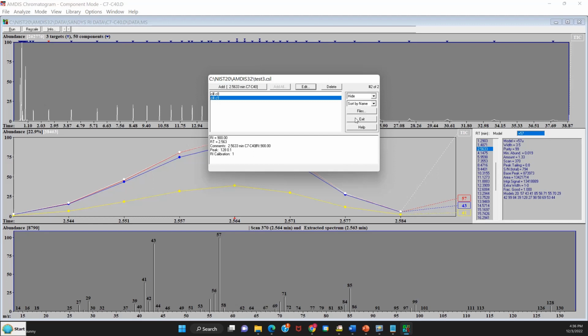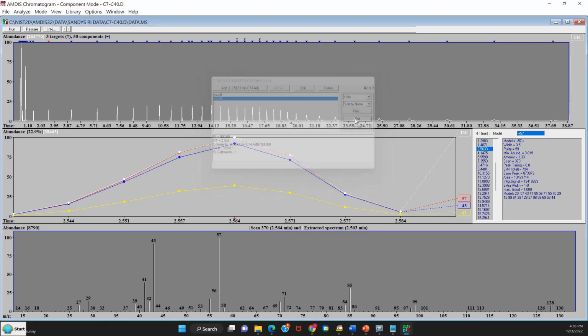So that's pretty much the process, and when you exit this, you'd be able to go find that file and open it up in Notepad and look at it, edit it if you needed to do some more editing, and make sure it's okay. So that's pretty much the whole process, and so I hope you found this video useful and can apply it in your work.